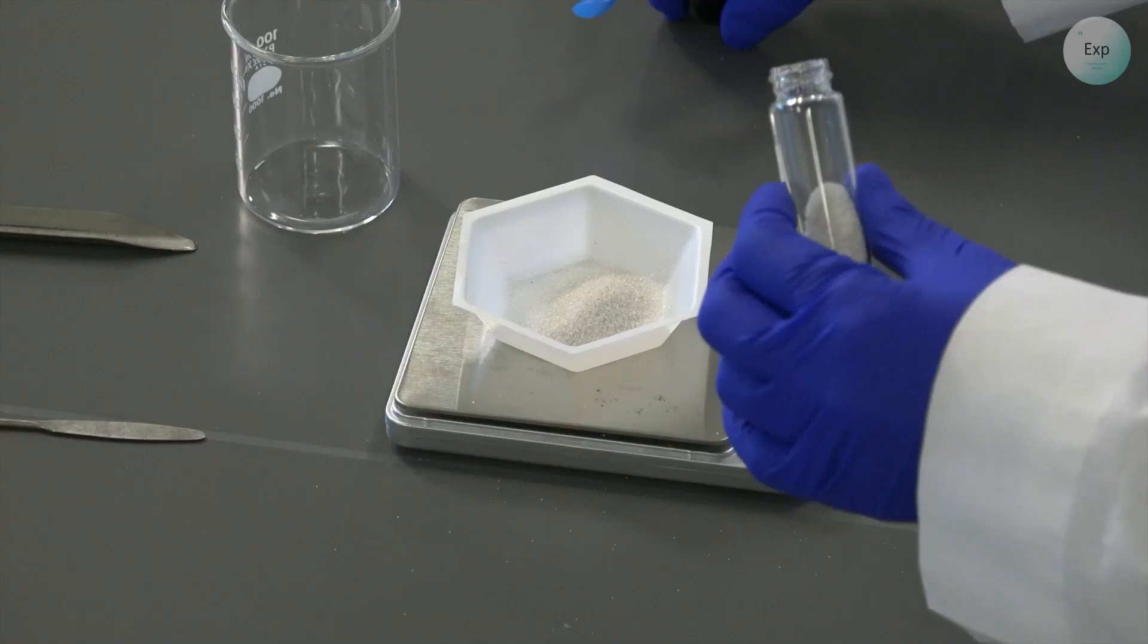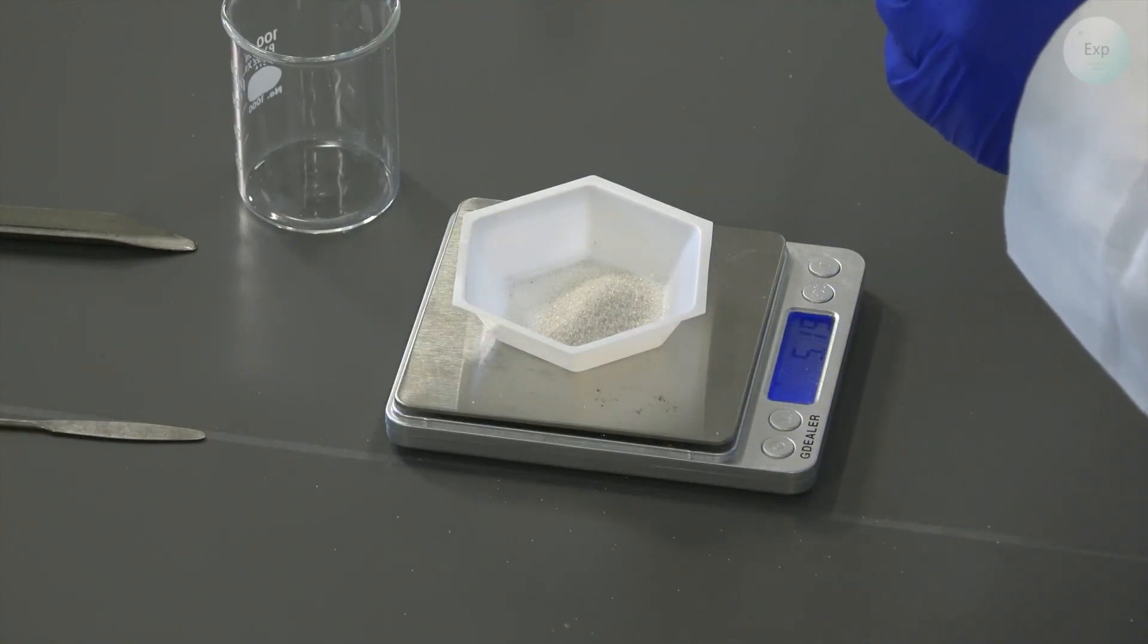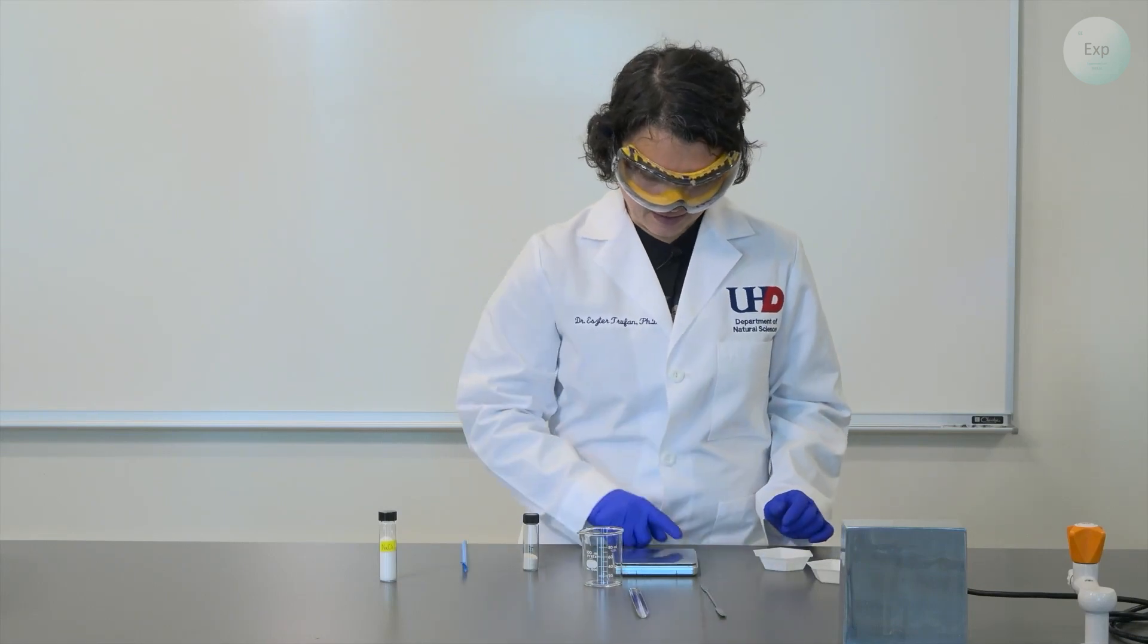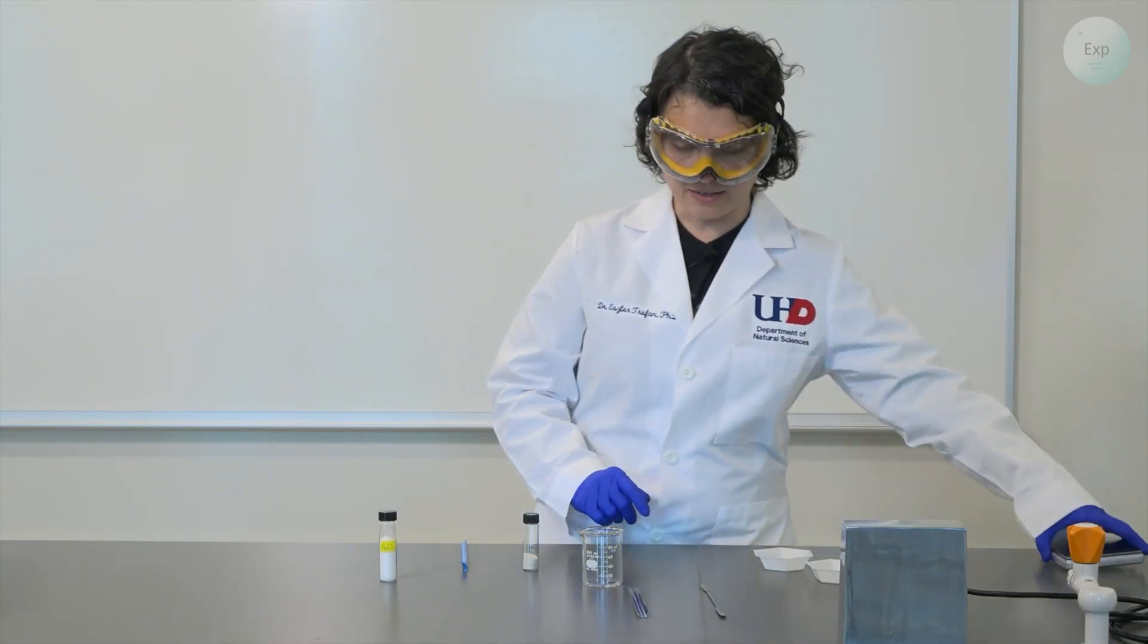This is a little bit more. It is 5.19 grams of sand. I can set it aside and turn off my scale and set it in the corner.